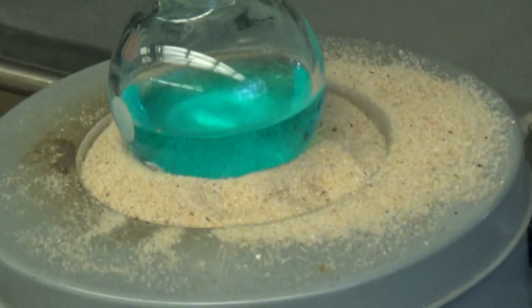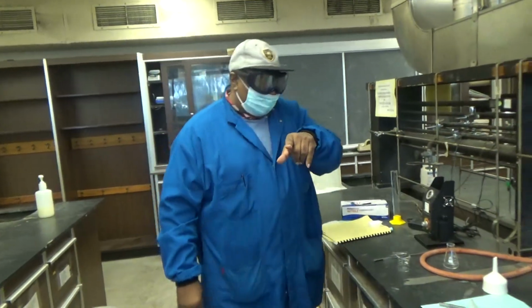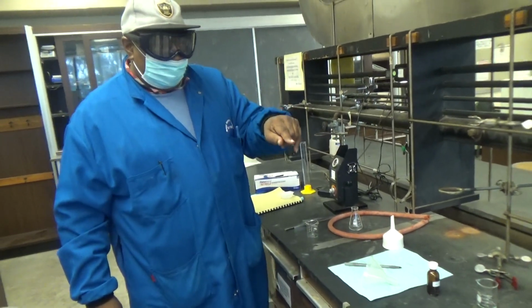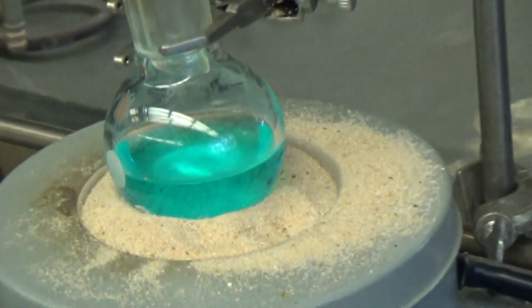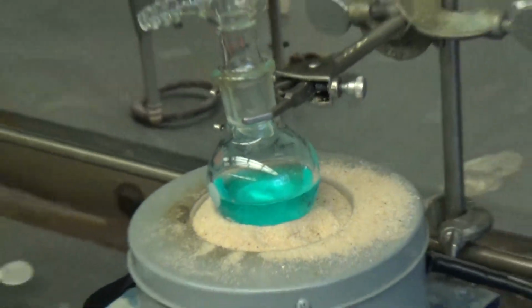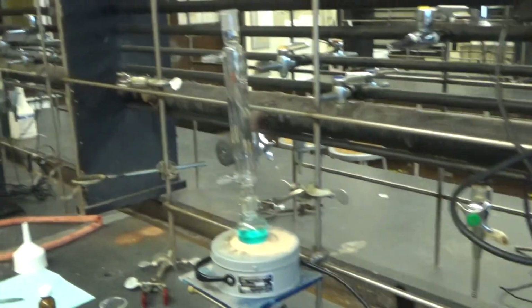It smells like vinegar, kind of, because that's probably the copper acetate. Why does it smell like vinegar? It smells like vinegar because you have a solution of cupric acetate in acetic acid. That's why it smells like vinegar. When they label the bottle, they did not label it right because it's copper sulfate in acetic acid. Or cupric acetate in acetic acid.